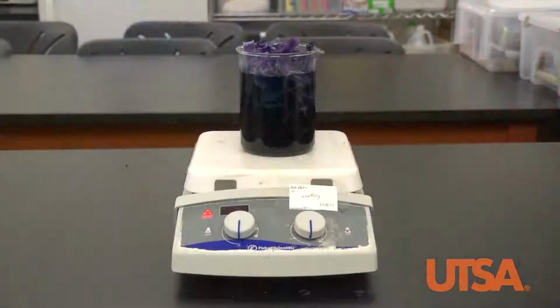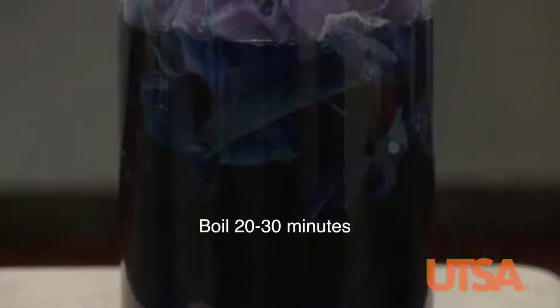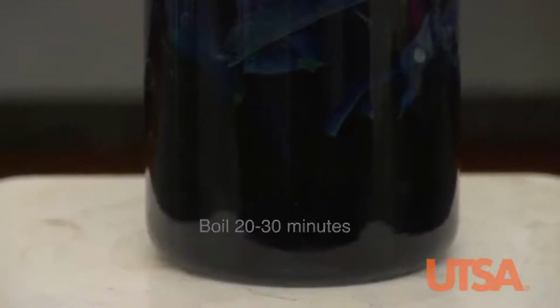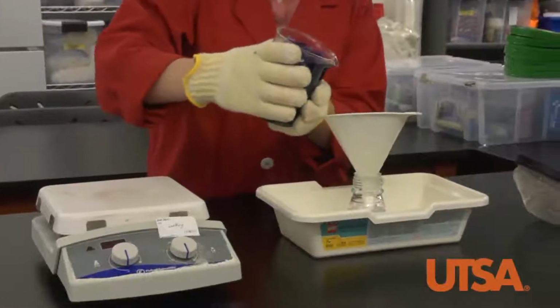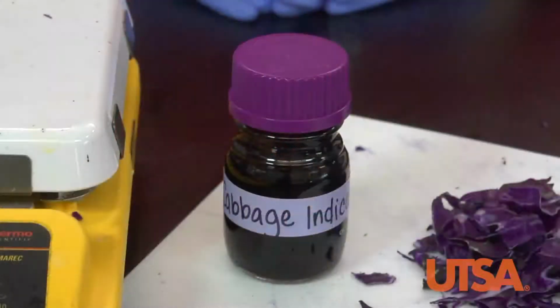The water and cabbage should then be boiled for 20 to 30 minutes until a dark indigo color is noted in the water. The indicator should be decanted into the closable container using the strainer and allowed to cool to room temperature. The indicator should now be ready to use.